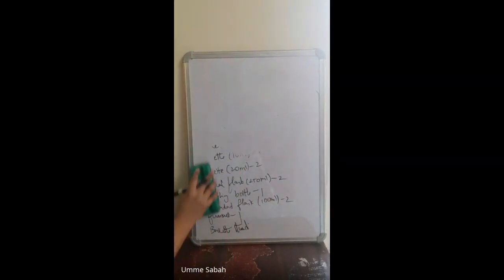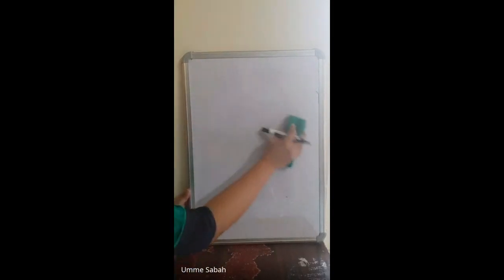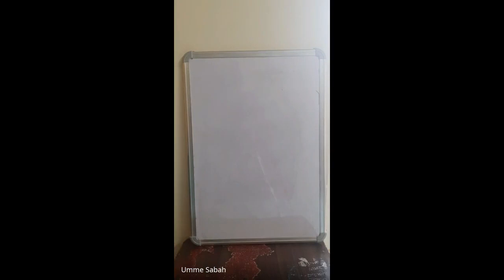Now we are preparing potassium dichromate solution. Reagent potassium dichromate has to be prepared. How are we preparing potassium dichromate? Please take the proper compositions. You have to dissolve 5 grams of potassium dichromate salt in distilled water. So you'll be dissolving 5 grams of salt in distilled water.